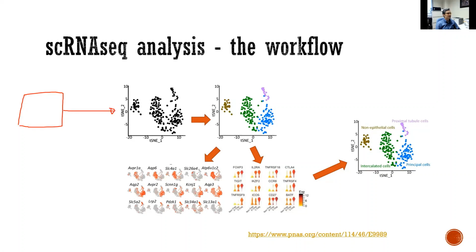Last lecture we mentioned the dimensionality reduction algorithms. We can use one of them to reduce the dimension so you can visualize the distribution of the cells by their similarity. In this lecture, we are going to introduce how to identify the clusters among these data points. That's our focus of this lecture, clustering analysis. This is the basis for cell type identification, because we want to group cells first, then use marker gene information to determine what the cell type of this group of cells is.